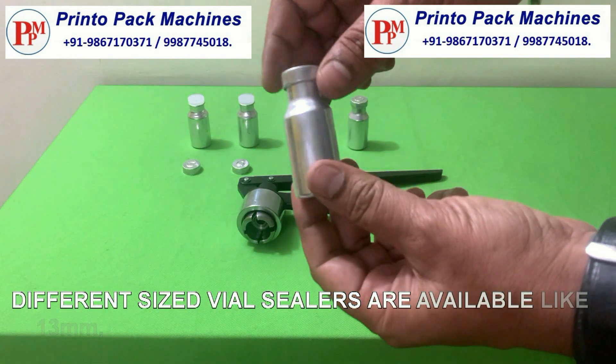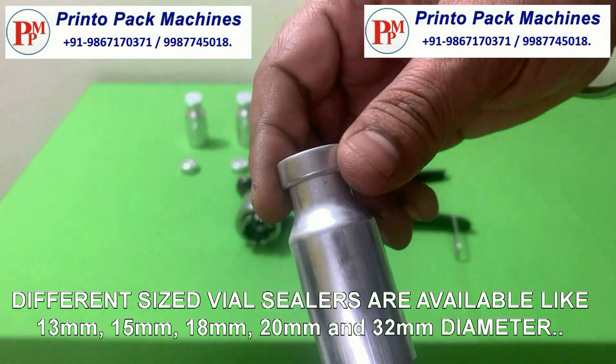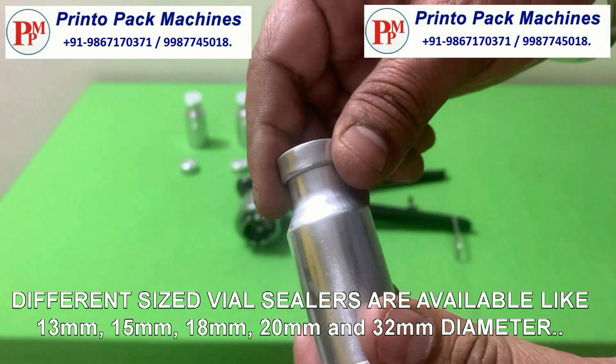This sealer is available in stainless steel GMP model in 15mm, 18mm, 20mm and 32mm diameter.